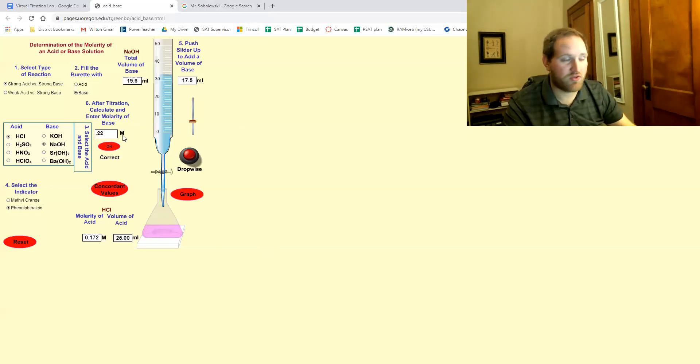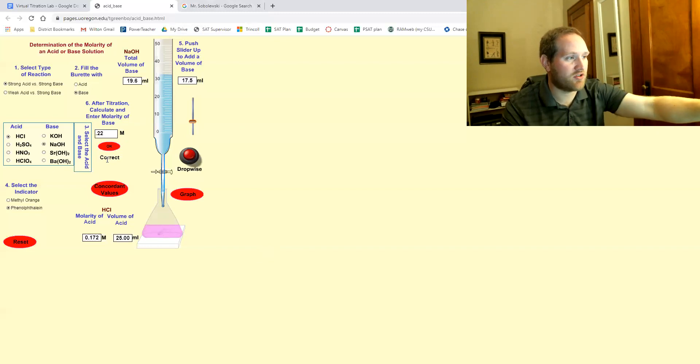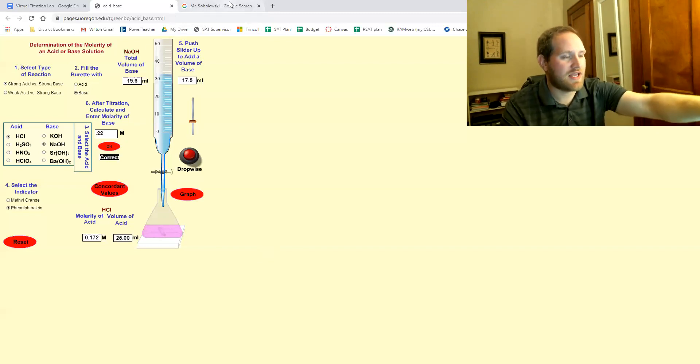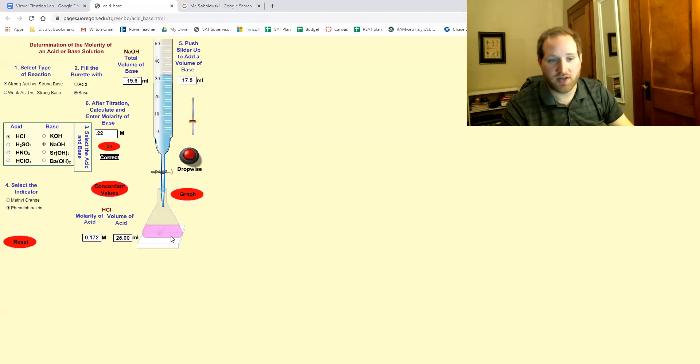So you need to have this with the correct, you have your name and you need your faint pink color here.